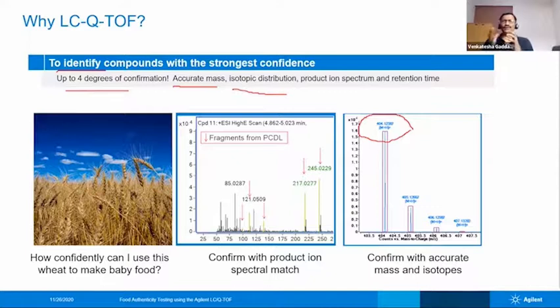And then you also see isotopic distribution. Whenever you form a molecule which has carbon, hydrogen, nitrogen, carbon has an isotope. It's not just C12, it also has C13. What is the effect of C13? You can see here, because of the C13, you get some additional mass. Your Q-TOF should be able to measure that in your formula. That gives higher confidence. So that is isotopic distribution, or we call it isotopic fidelity.